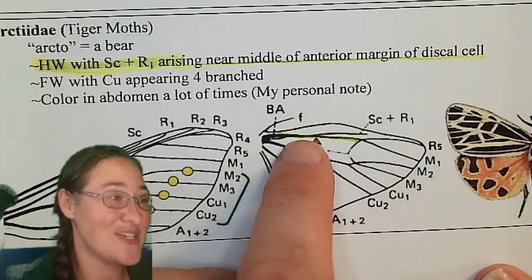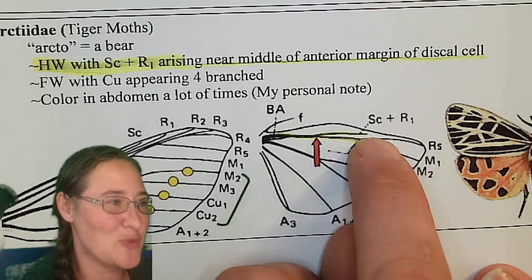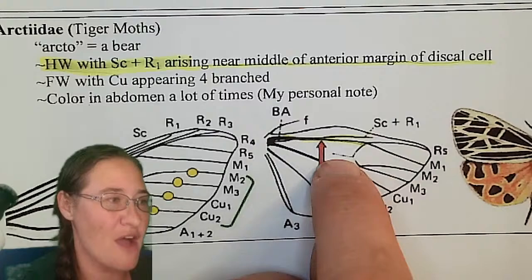This is the hindwing. So this is an area that would definitely be covered by the front wing when it's pulled up like that. And ideally, we're supposed to be able to see this little half vein that comes up off of this cell. That is a super tricky one to see. But let's see if we can find it.